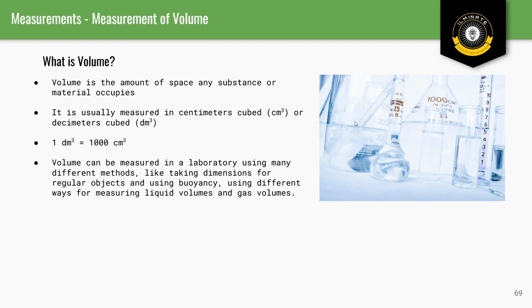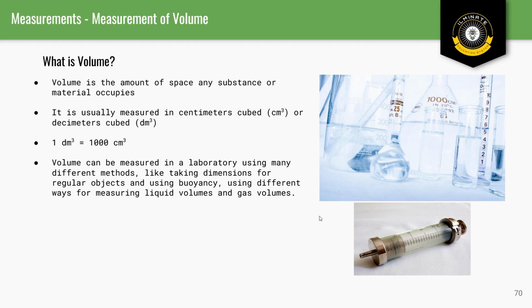As you can see here, these are some of the apparatus for measuring volume. And this is a gas syringe. This is used for the measurement of gas volumes.